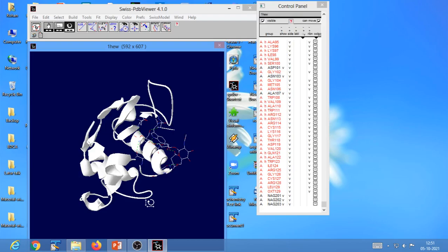So this is all I want to show. What we have learned in today's demonstration session is the different ways you can visualize your protein molecule, the different ways you can select and display your protein molecules, and we have visualized our protein molecule in a more efficient way in order to learn something from it. If that is what you have learned, the objective of today's practical is over. In our next session, we would be learning about measuring and coloring, all those things.